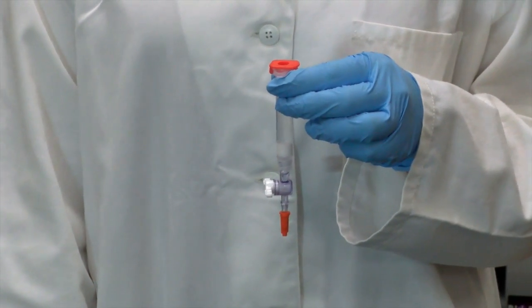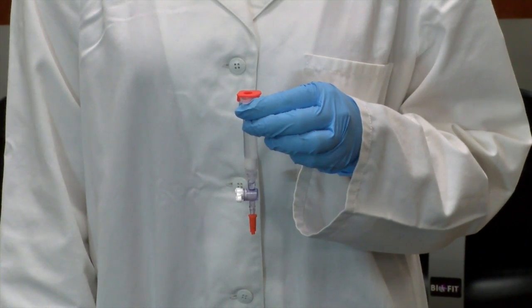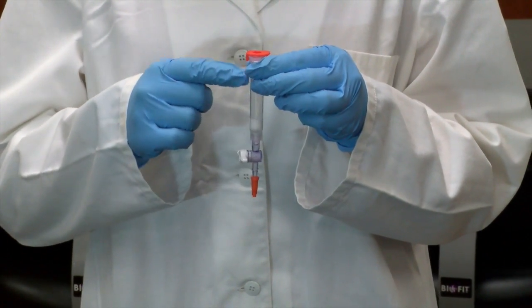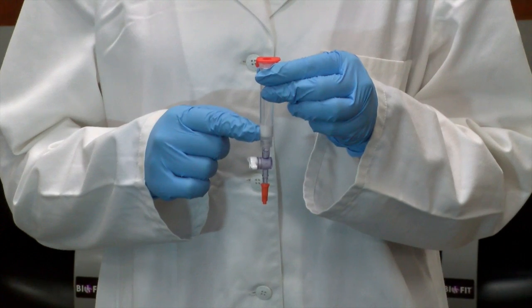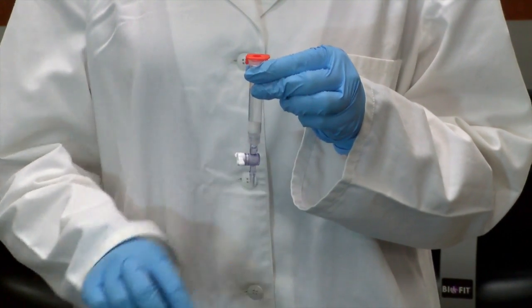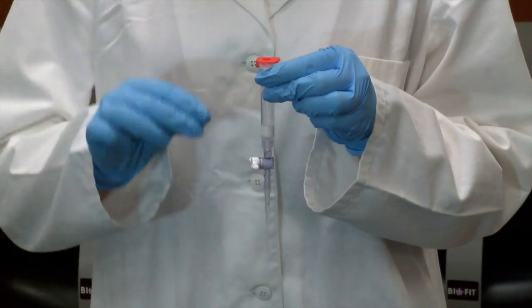These columns should be stored vertically and never be allowed to dry out. Each column will contain storage buffer and a white resin bed. The resin beads have been coated with a hydrophobic coating. There is a stopcock valve that controls the draining of the liquid in the column.